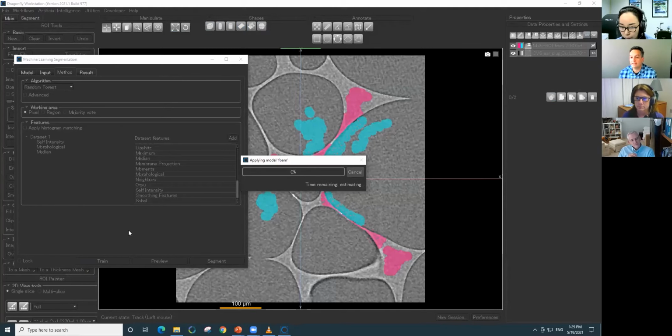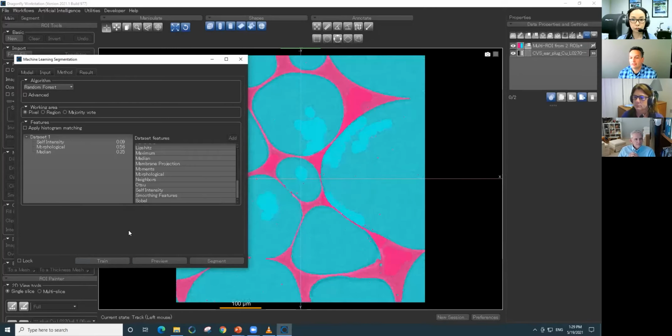So we got a question from James. This is actually a follow-up to Catherine's. He said, thank you for answering the mesh resolution question. And we may not be able to show it here, but where is the decimate option to decrease the resolution? So it may be that we have to address that after with one of the data sets you already did if it doesn't show up here.